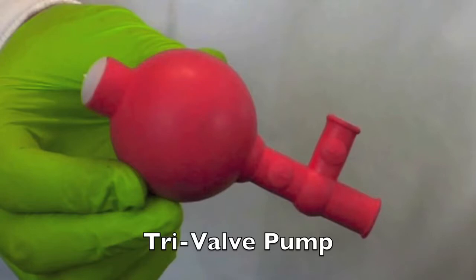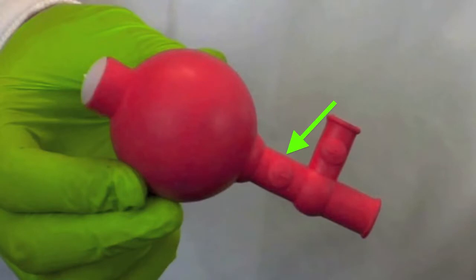A tri-valve pump has three valves: an A or air valve which releases air from the bulb, an S or suction valve used to fill the pipette, and an E or exhaust valve to empty any liquid remaining in the pipette tip.